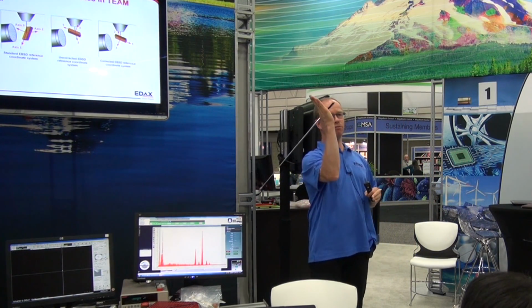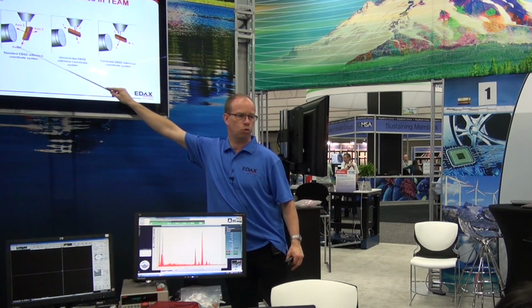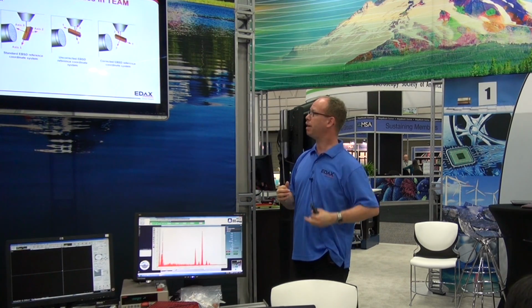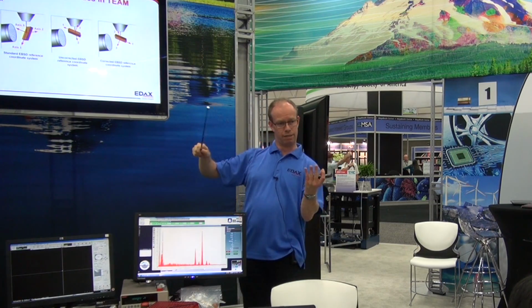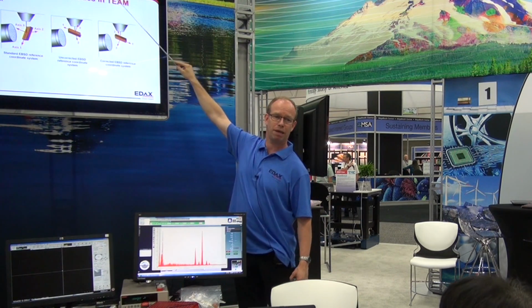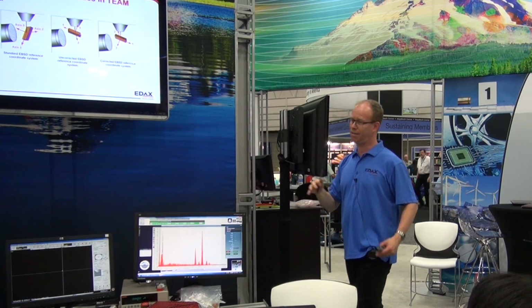If your sample is 70-degree tilted, this is the coordinate system that we use for normal EBSD to calculate the orientation that we measure from the pattern. If I mount my sample this way, I just rotate it, the coordinate system rotates along with it if I don't correct for it. And then it's going away from my EBSD detector. So basically my orientation measurement is totally wrong.